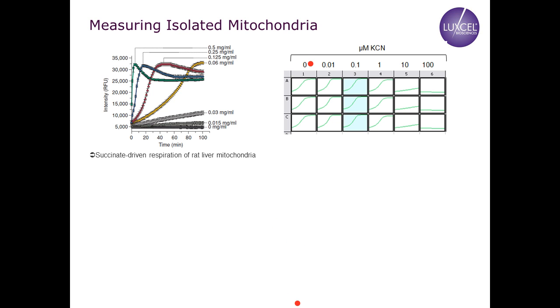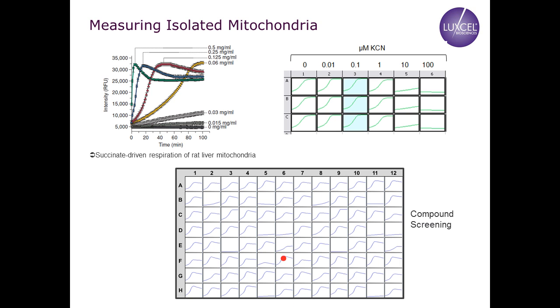So when one is screening individual compounds, you've got a plate map that you will view the data on any of the plate readers that would be doing the measurements, and Wendy will go into this in much more detail as to how the instrumentation is outputting those systems and how they're optimized on the BioTek measurements.